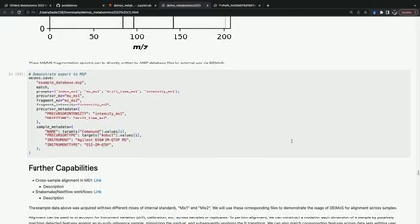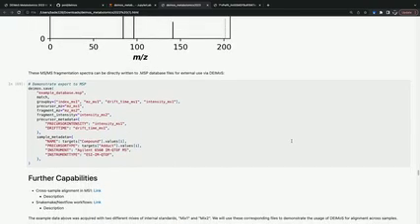DEIMoS also includes the ability to save data into the MSP format, in case, for computational workflows where you extract many MS2 spectra, you may want to save that into a standard database format. Many of you are likely familiar with MSP. You can just apply those parameters into the DEIMoS save function, and it'll save as MSP automatically.